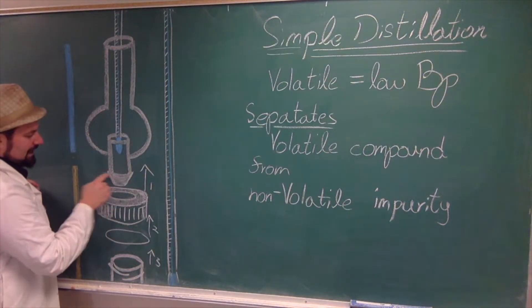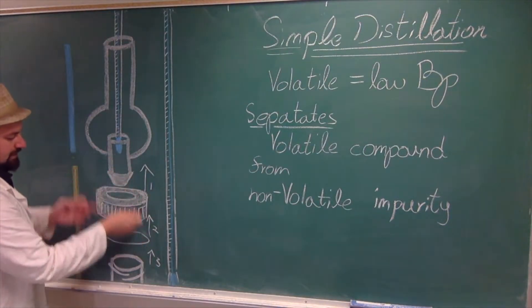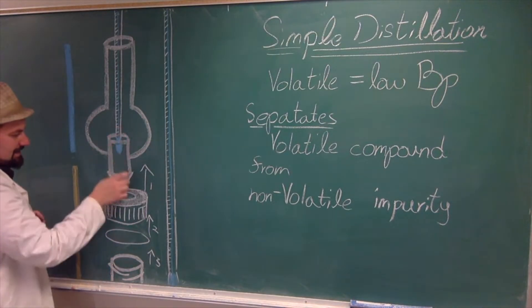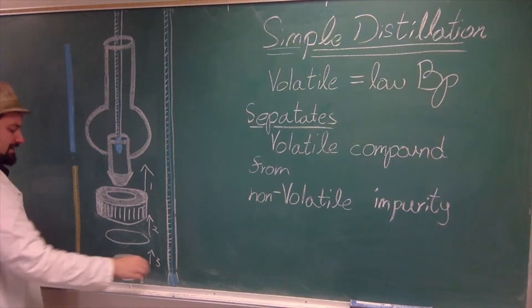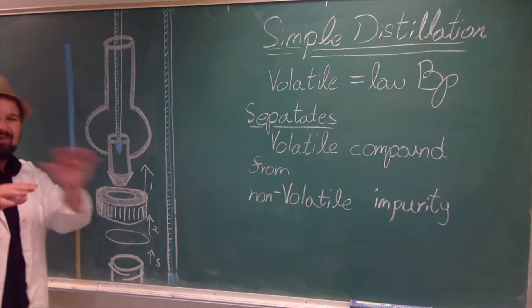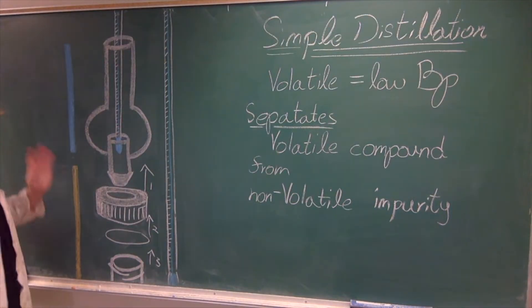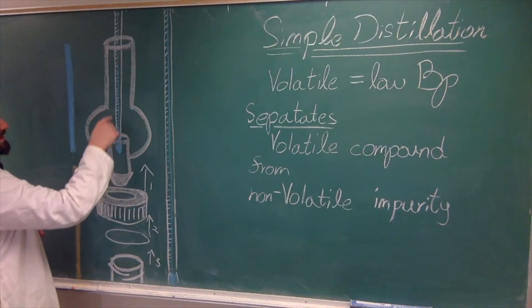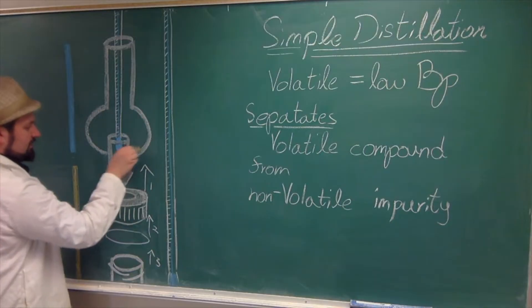You'll notice there's a different-colored lip on this piece of glassware — both pieces must pass that lip, otherwise you won't seal it properly. For the Hickman itself, the inner tube is inside and the outer part is the big ball area where it collects. The bottom part is the hot area, and the top is cooler — cooler than the boiling point but hotter than ambient. What you'll see is the compound evaporating from the bottom, condensing along the sides, and collecting in that collection well.